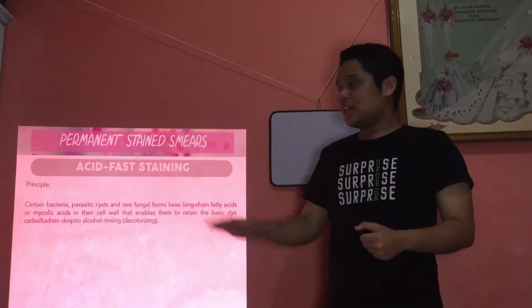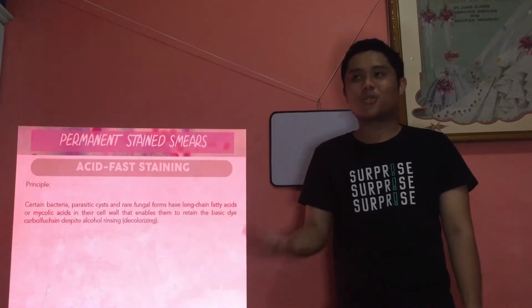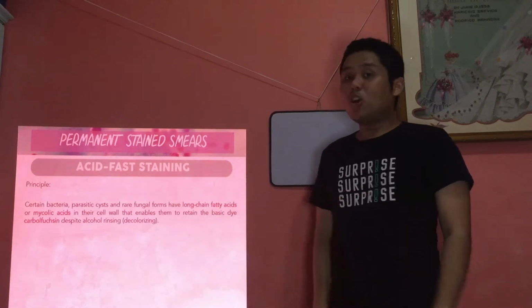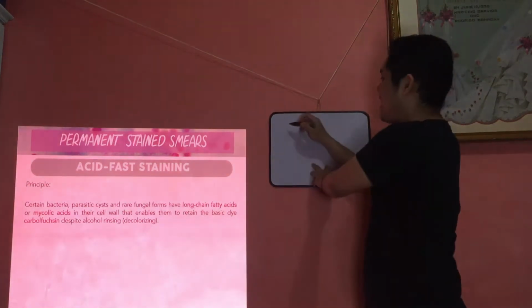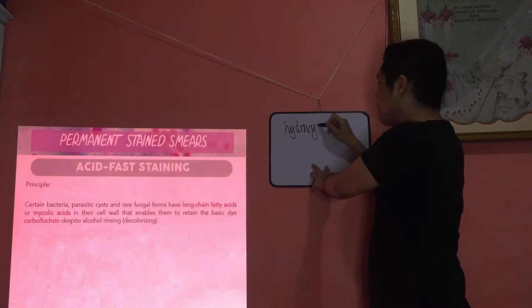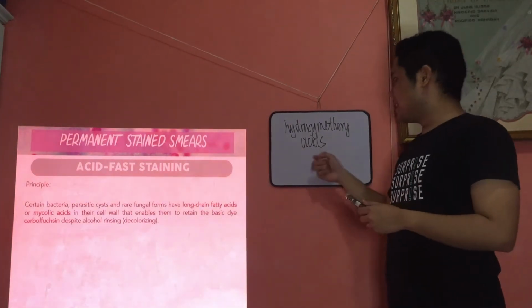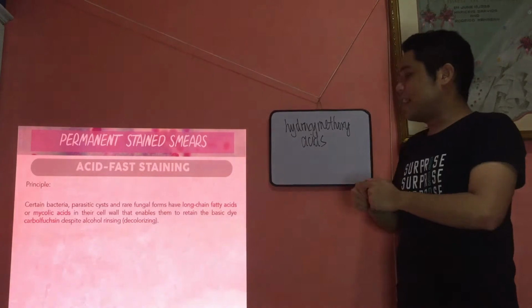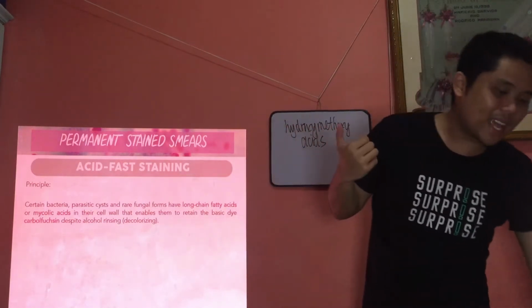Now, what is the principle of acid fast? Certain bacteria, parasitic cysts, and rare fungal forms have in their cell wall what we call long chain fatty acids, also known as mycolic acids, or also known as hydroxy methoxy acids. Please take note. Hydroxy methoxy acids. That's the other name: mycolic acid, long chain fatty acids, hydroxy methoxy acids. They have these acids in their cell walls.